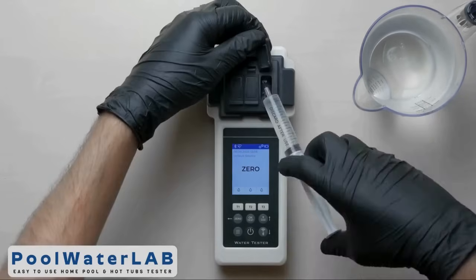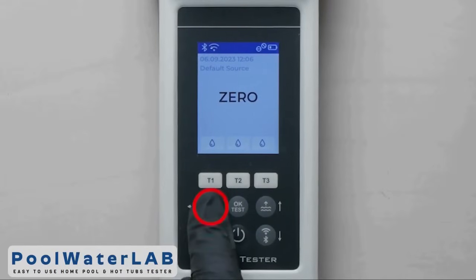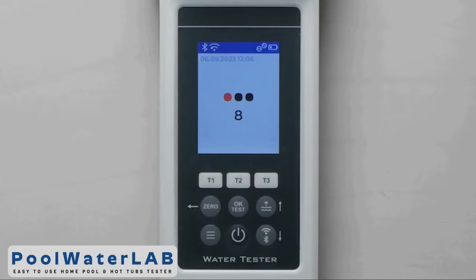Cover the camera with a light protection cap and press the zero button. Wait until the countdown ends.